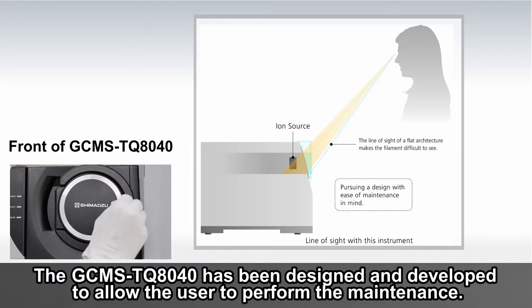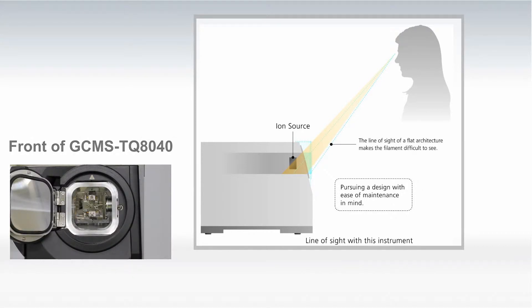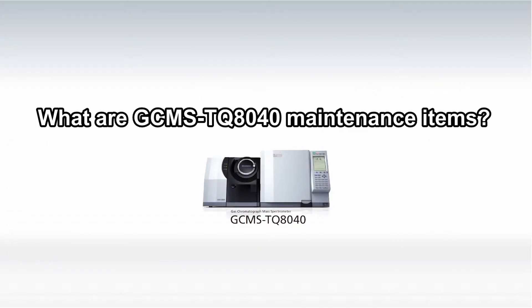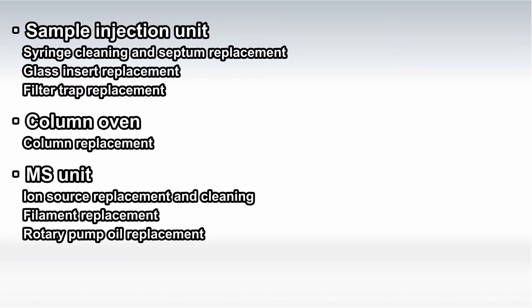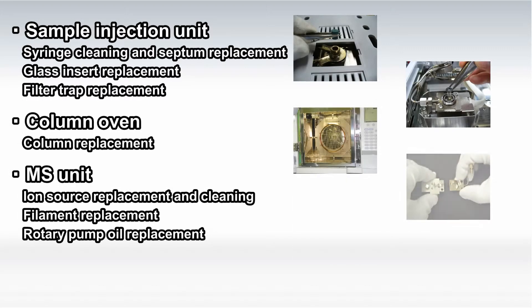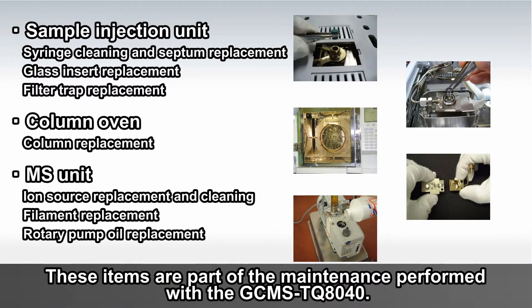The GC-MS TQ8040 has been designed and developed to allow the user to perform the maintenance. These items are part of the maintenance performed with the GC-MS TQ8040.